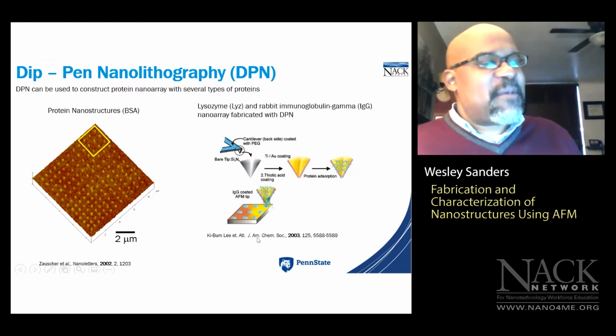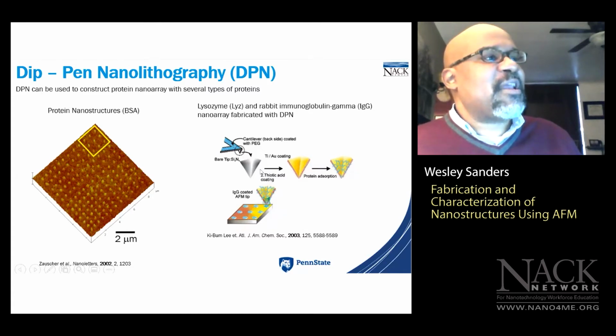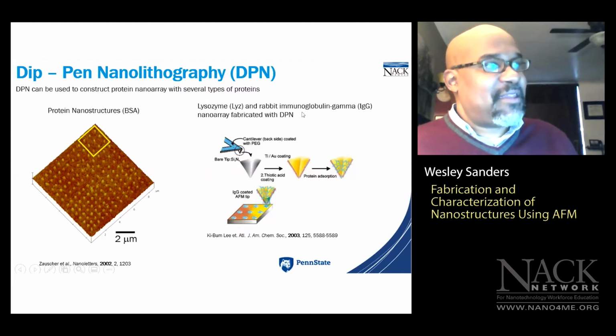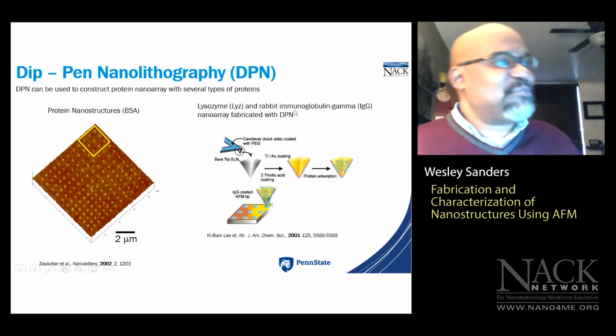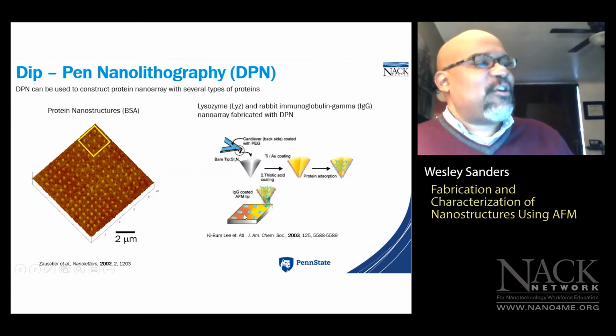And then a report coming out of the Journal of American Chemical Society, a 2003 report, shows lysozymes and immunoglobulin proteins deposited on a gold surface.